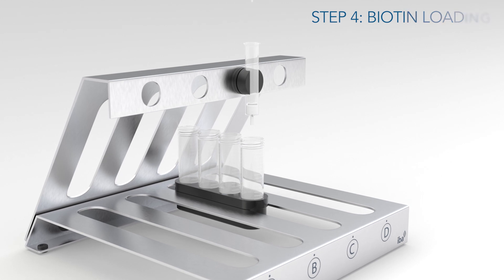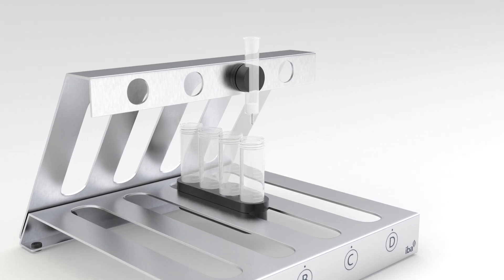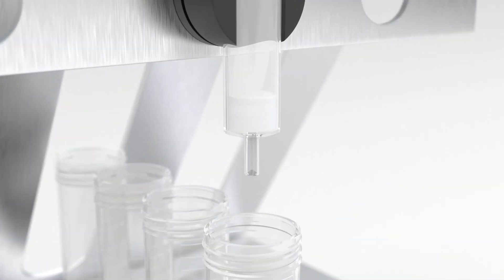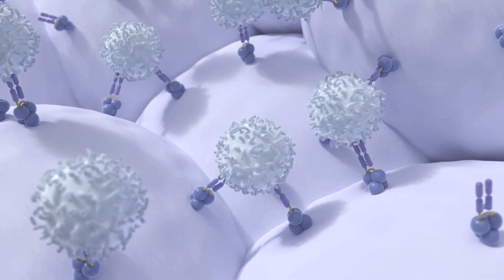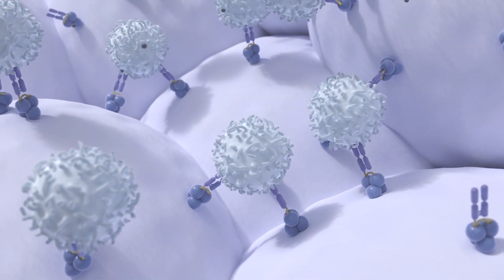Finally, the addition of biotin triggers the elution of the target cells, and the fab streps spontaneously self-dissociate from the cell surface due to the reduced affinity.